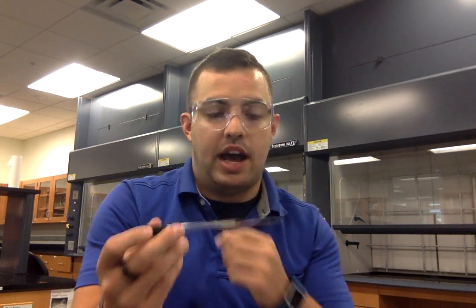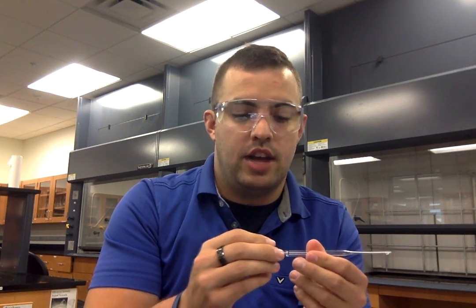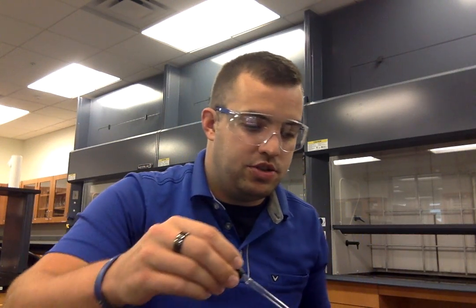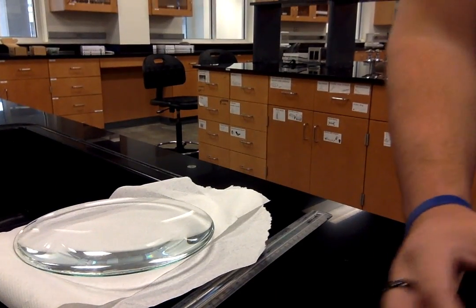So then, if you haven't gotten it to 0.1 milliliters, you're going to have to get a different pipette, or if you did end up having 0.1 milliliters, then you're going to use that same pipette. Then what you're going to do is get a large watch glass. As you can see right here, I have one already.